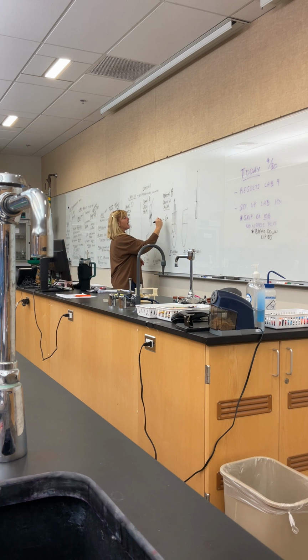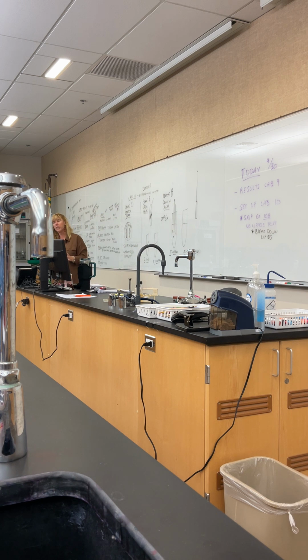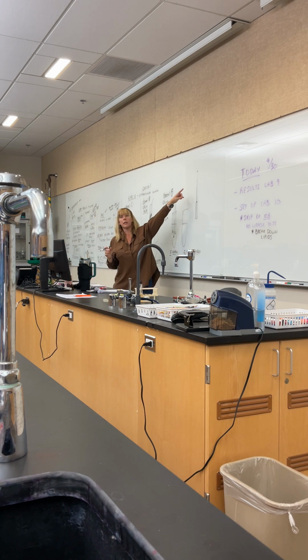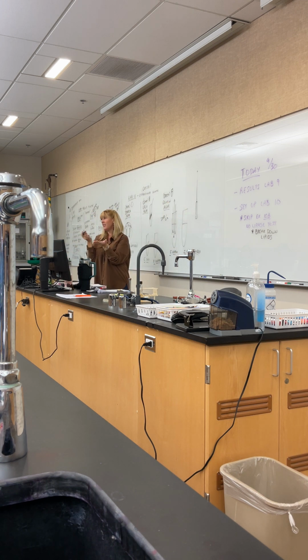You're gonna do a stab 6 times. You have to stop at 6. I know we wanna keep going because we have a lot of aggression built up, but we wanna stop at 6, all right? And I'm not stabbing in the same spot. I'm moving around in the media. What I'm doing is I'm putting a lot of bacteria in there. Now, I don't have to keep going back to the plate. When I pick up all of those cells to where I can see the paste, I have plenty. So each time I'm stabbing and lifting out, I'm dropping off a lot of cells. Don't worry, there's a lot there.